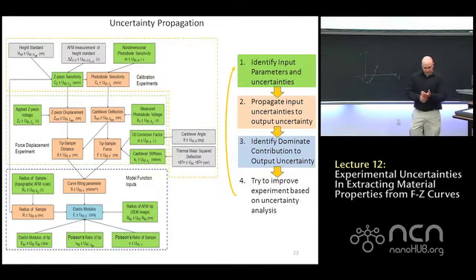So for the specific AFM experiment we're talking about, we can consider that data reduction equation I was showing earlier as looking something like this. We have a collection of what I've defined to just be input parameters. So our sensitivities, our calibration, so C_Z, M, K, sorry about that.